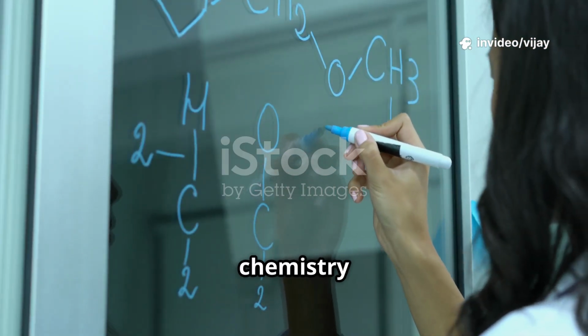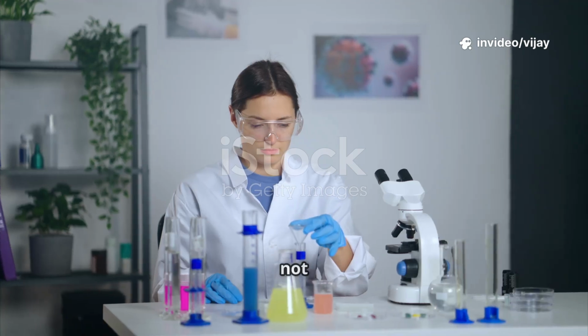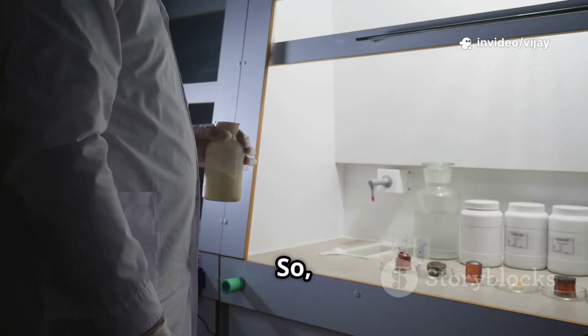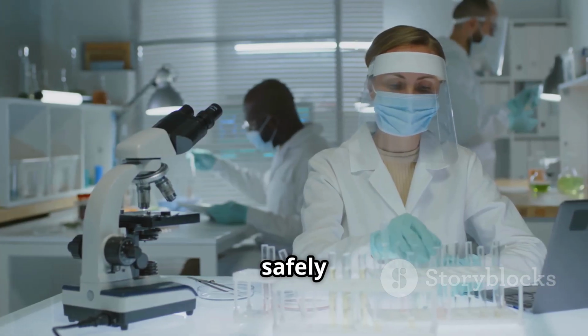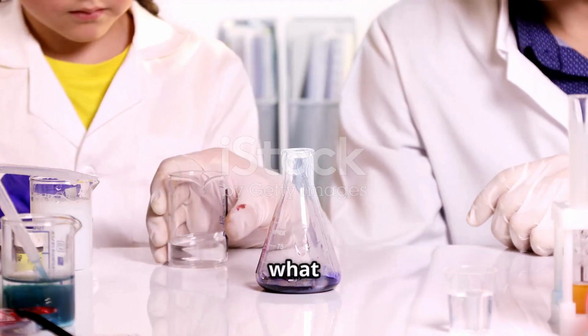Ozonolysis, that's one of those chemistry words that sounds intense, but honestly it's not as intimidating as you might think. So, if you're ready to tackle this reaction in the lab, here's exactly how I do it, safely and step by step. First up, what is ozonolysis?